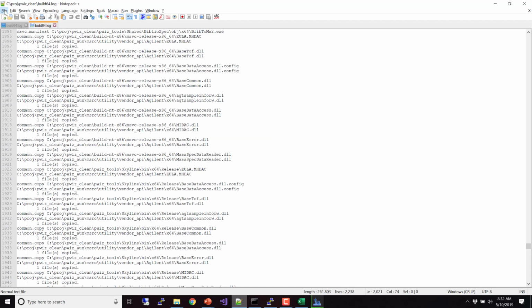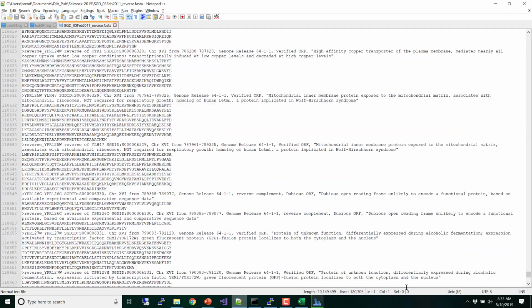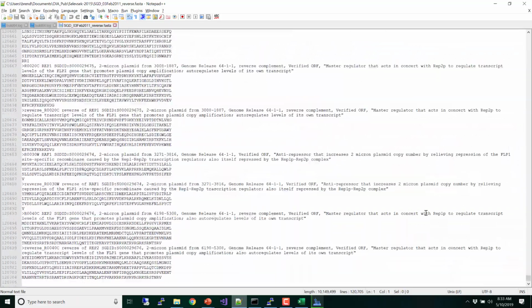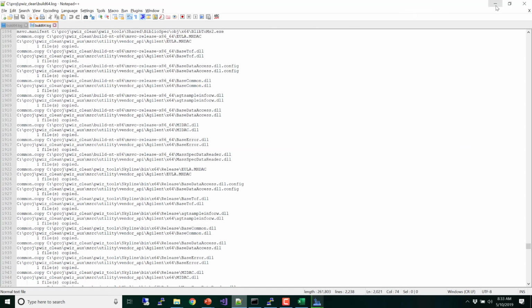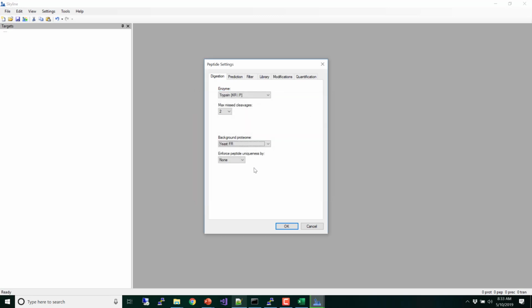So I went and opened it, and everything's getting doubled at the beginning, so I went, oh, let's look at the end. And I couldn't see anything immediately at the end either. Yeah, maybe there are contaminants in here. I think the IRTs are also in here. Not positive though, maybe not. No, I mean, they have to be finding the IRTs, so there must be IRTs in here. Okay, so anyway, that's it. We've got our background proteome. That's what they actually searched.